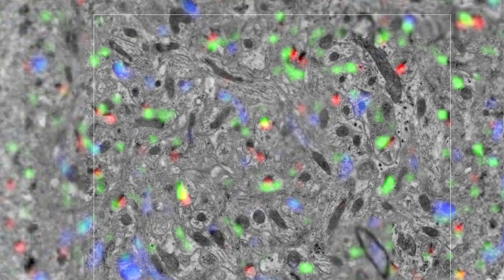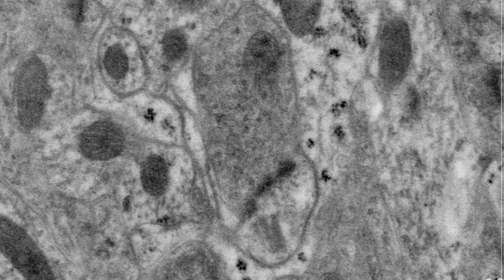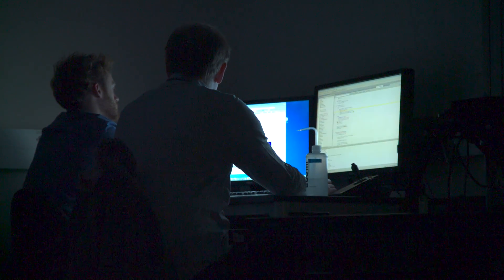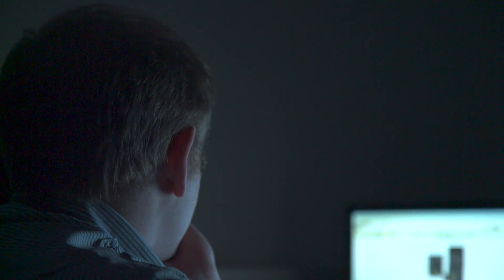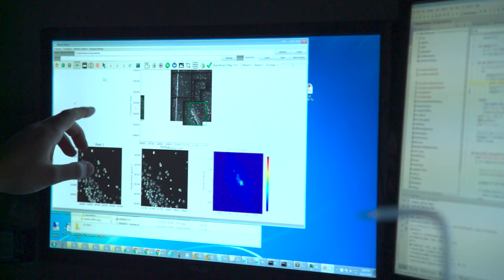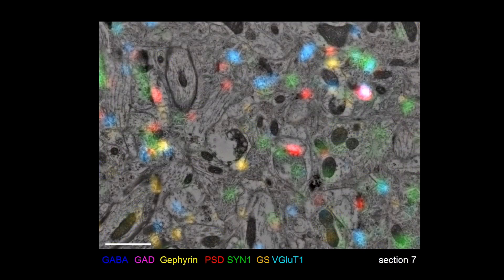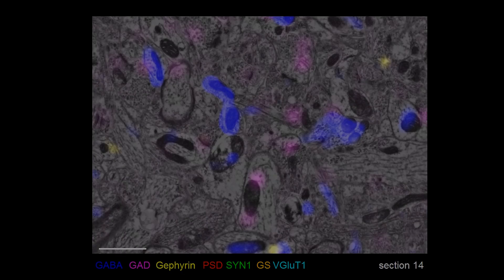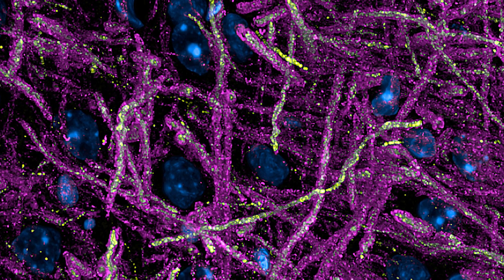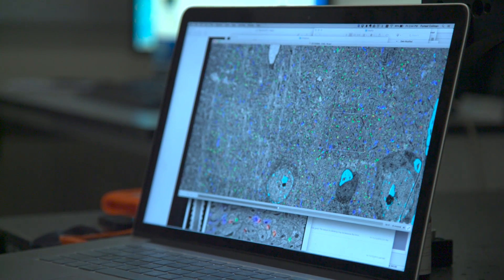Array tomography is a method for very high resolution imaging. What makes it different from many other kinds of microscopy is that not only can you look at very high resolution at biological structures, but you can identify many different molecules. We're trying to understand what are the different types of neurons that exist in the brain and how those different types are connected to one another. Array tomography allows us to reconstruct individual synapses at high resolution and look at their molecular composition in 10, 20, or 30 different colors representing different proteins. We've achieved beautiful, revealing views of very small pieces of mouse and human cortex, but we have to enlarge those volumes to include complete circuit modules of the brain.